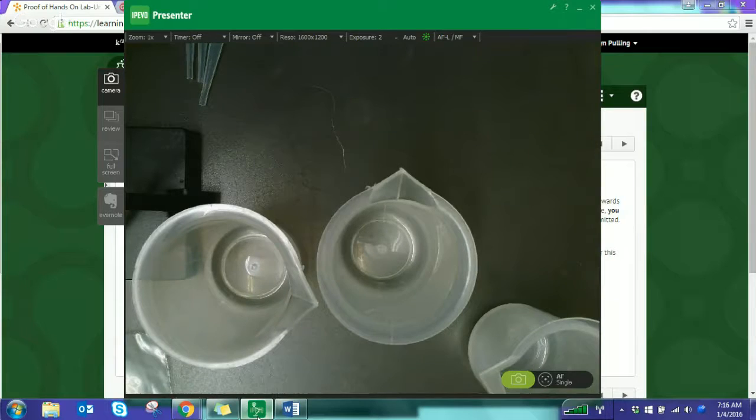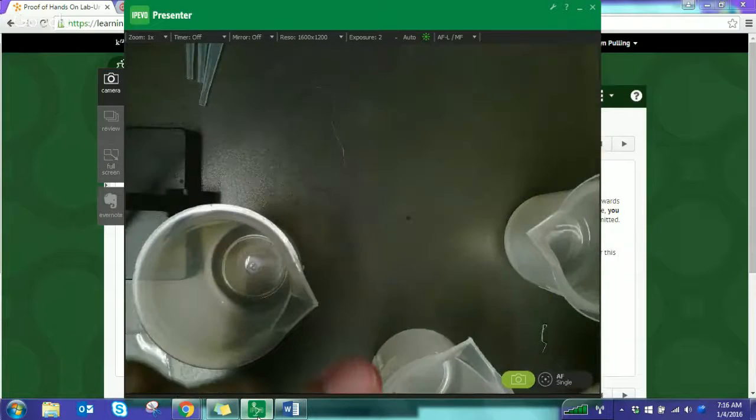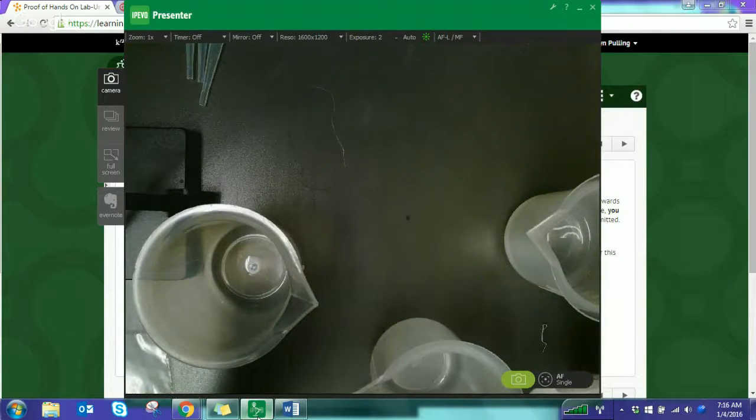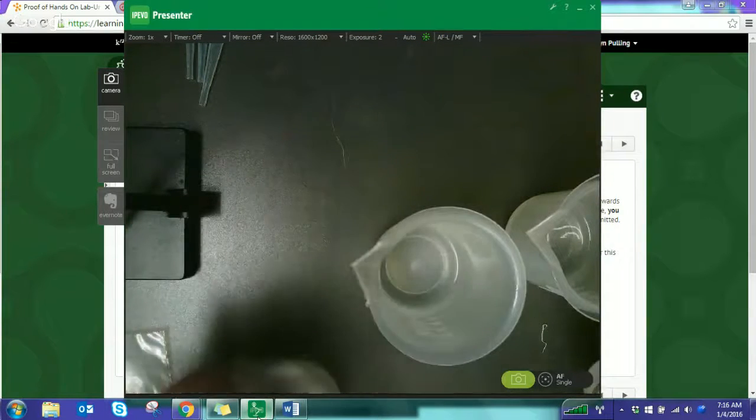Oh, I got the foil off, but there's still a layer of plastic that's not off. There we go. And I'm just going to pour it to actually that very first line. That should be enough, because I won't want to run out of alcohol. Which I believe then would be the 10 milliliter mark. Because I know my papers hang low enough to touch.